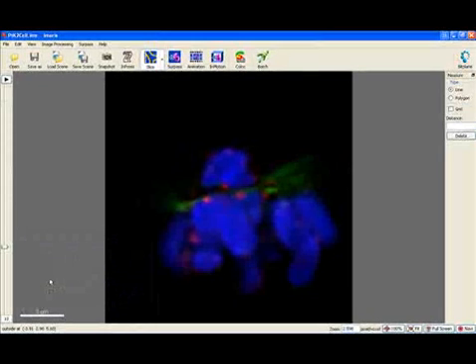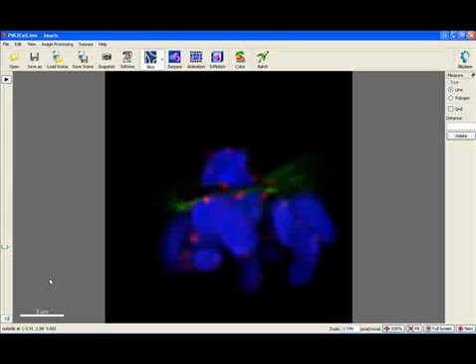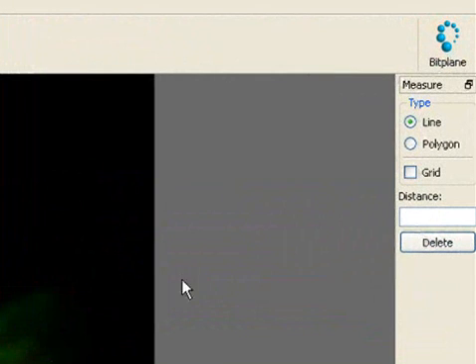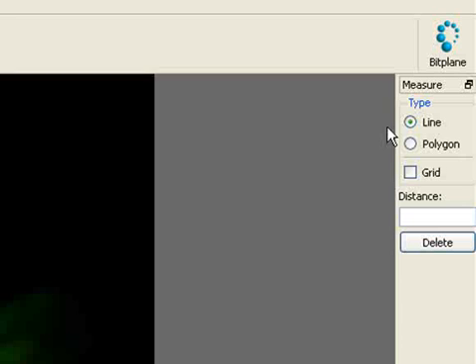The measurement feature in slice view is used when you don't need to save measurements but rather to determine quickly the best parameter and filter settings. There are two types of interactive measurement. Depending on what you want to measure, you can either choose line or polygon.